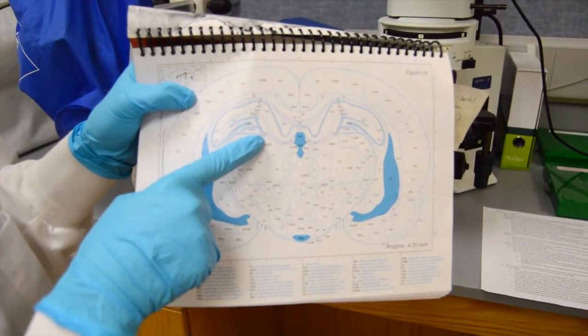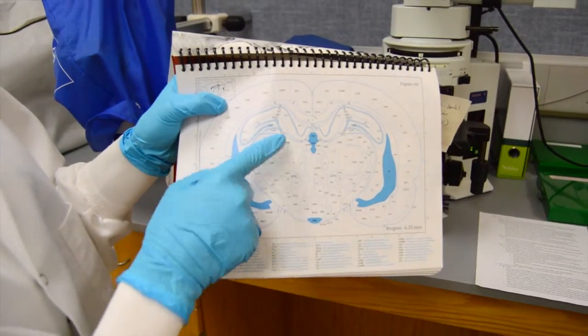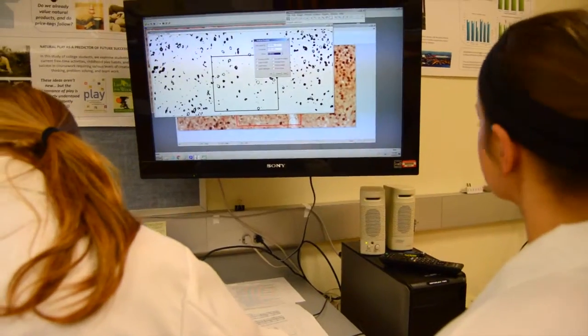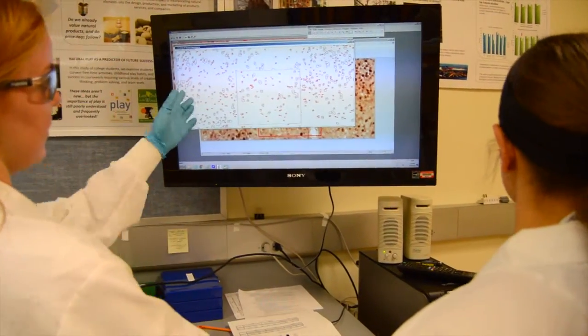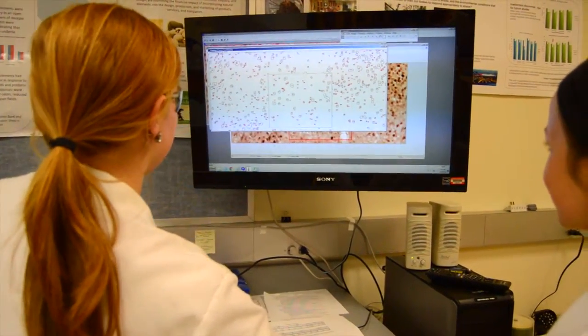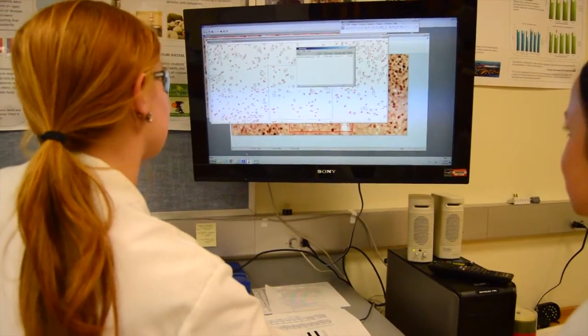Once the visualized field is selected for the image to capture, open ImageJ to analyze particles. Here, the darkly stained circles are the neurons to be counted. The results will appear in a new window and record it in an Excel sheet.